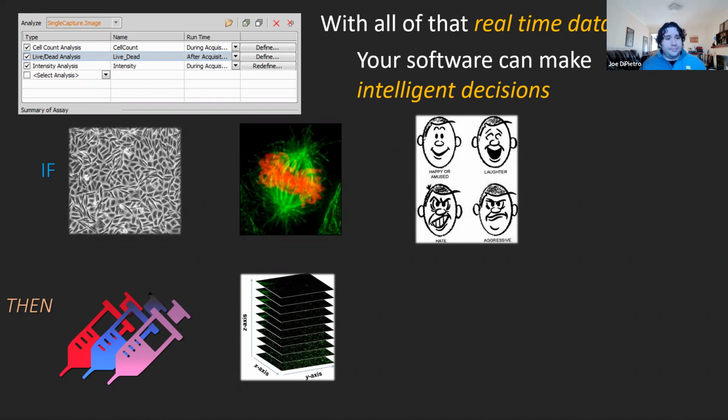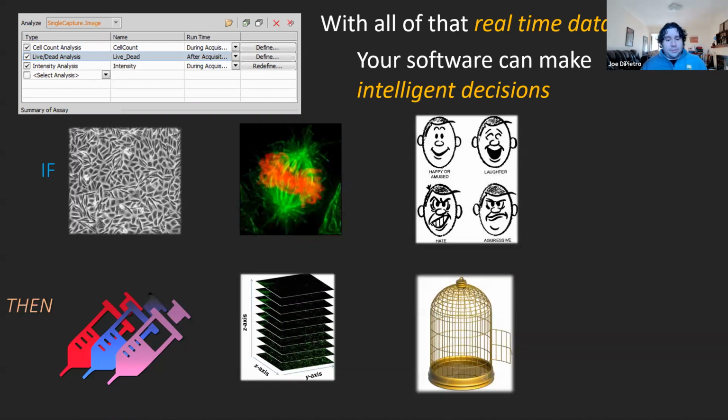This state might manifest itself in different ways. Maybe the color of the protein changes, or you get expression of a different protein, a different channel, right? And then you want to do an uncaging experiment with a laser that uncages glutamate or some other cell signaling molecule.